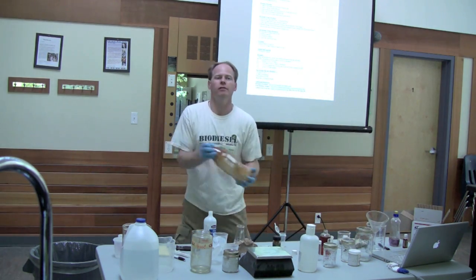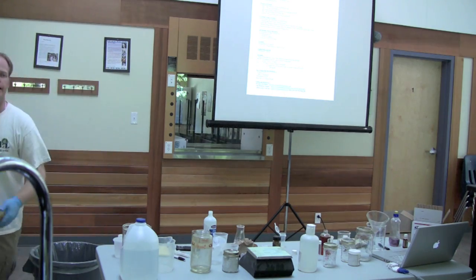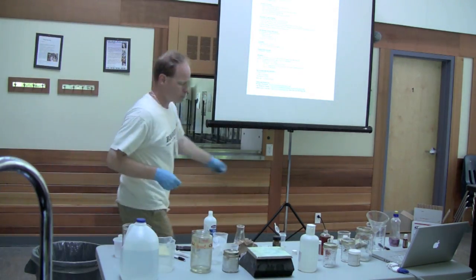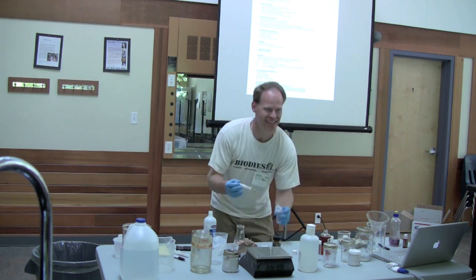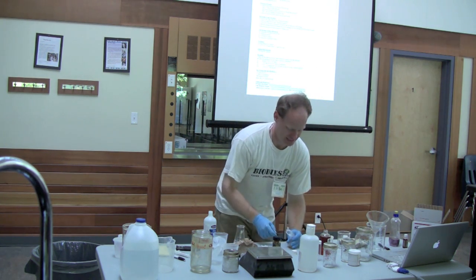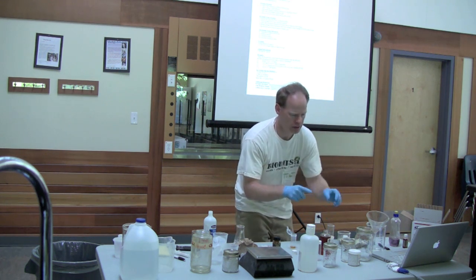Okay, I need everyone's help. Take it and pass it around and shake it. Give it a good shake. And go ahead and pass it to the next person. Pure methanol is here.